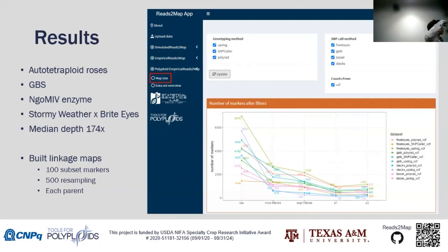So if we resample, I have at the beginning about 200 markers for each one of the chromosomes, 2,000 markers for each one of the chromosomes. So I can resample 100 many times, and I give chances to leave the bad markers out, and I will pick the method that provides me more good maps with these 500 resamples of 100 markers. And to be able to do this amount of markers, I separate the markers for each one of the parents, so I can run it fast.